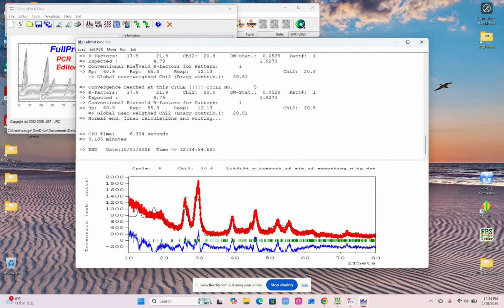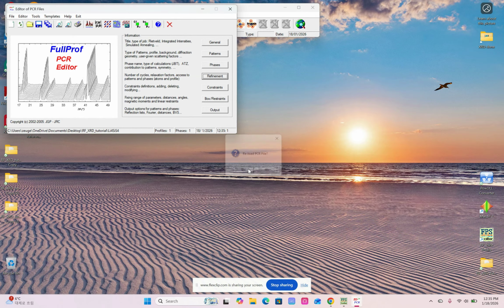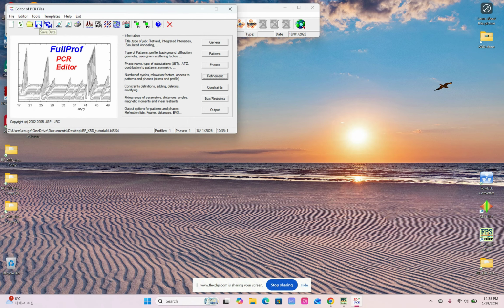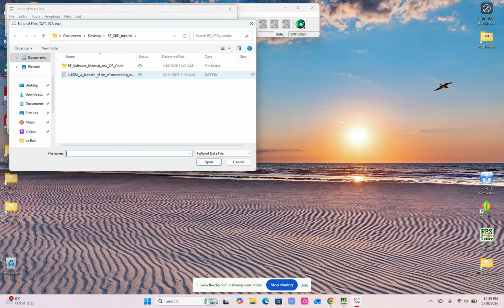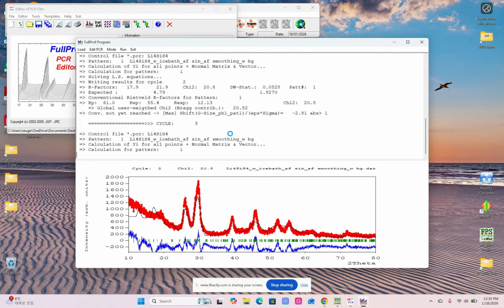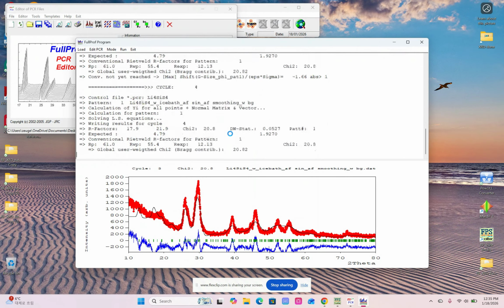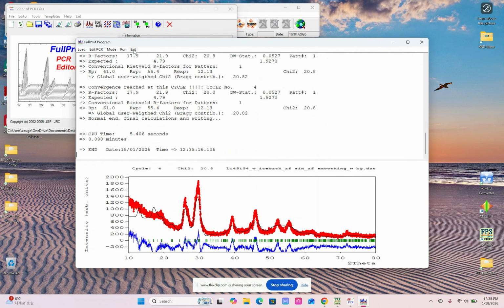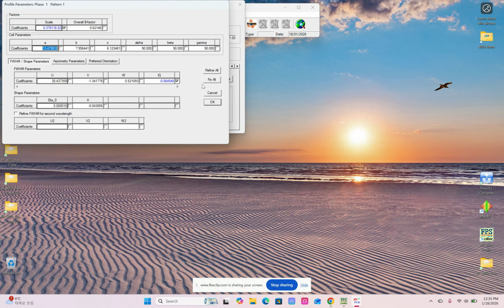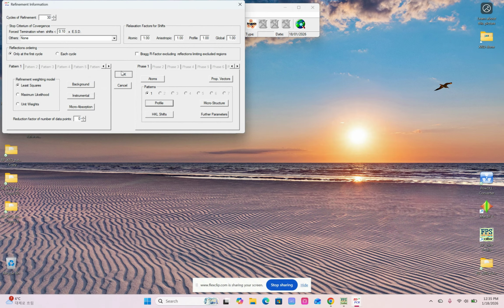All right, the error factor actually is already not that bad. Let's see how it will change after the refinement of all those parameters. Yeah, that one has not so much influence usually. Yes, exactly, nothing changed. So the shape parameter.